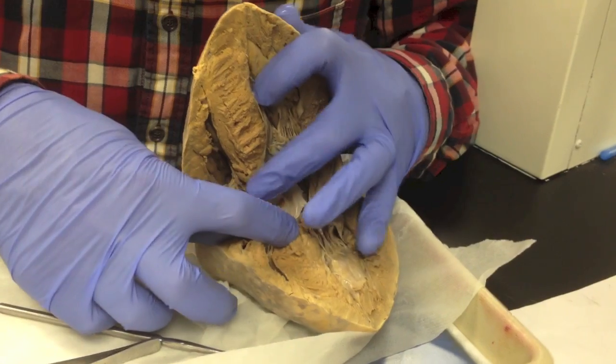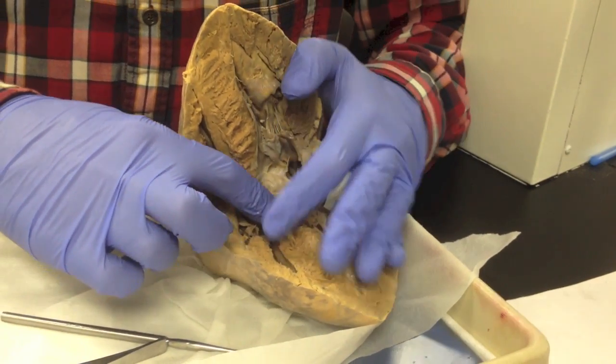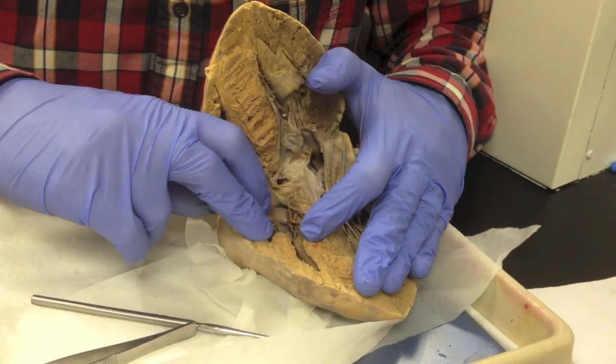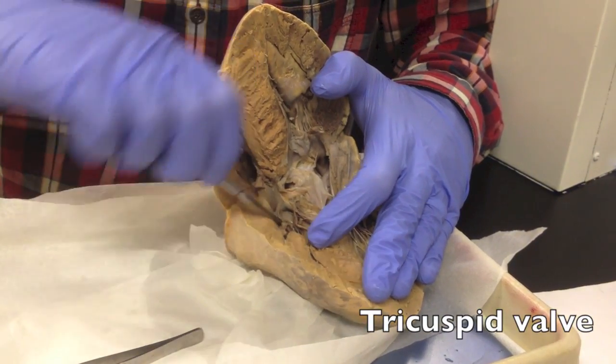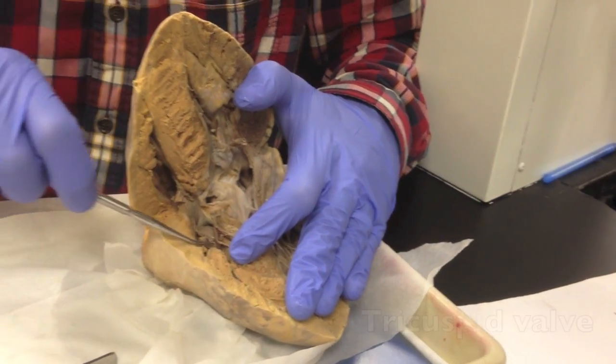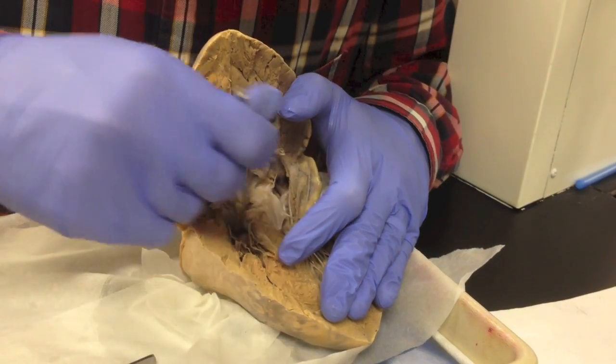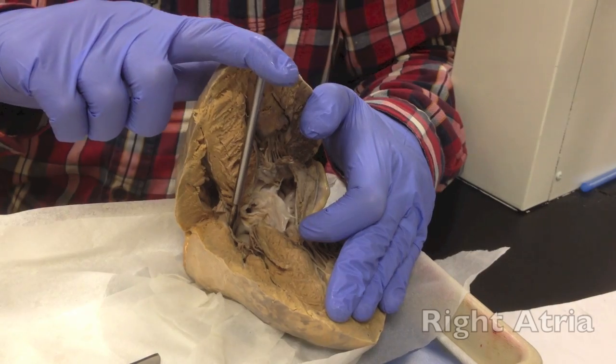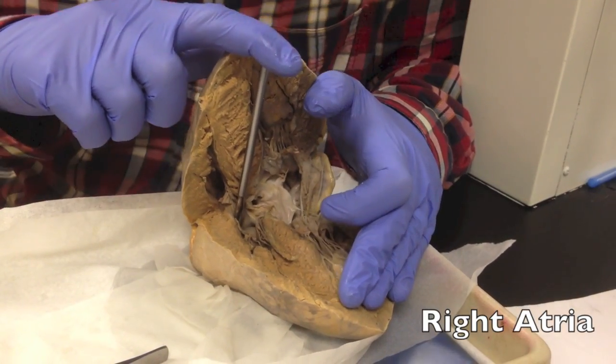Of course, on this side I'm also going to have a valve — another atrioventricular valve. This one has three cusps and is called the tricuspid valve. It also has the chordae tendineae, and going way deep there would be your right atria.